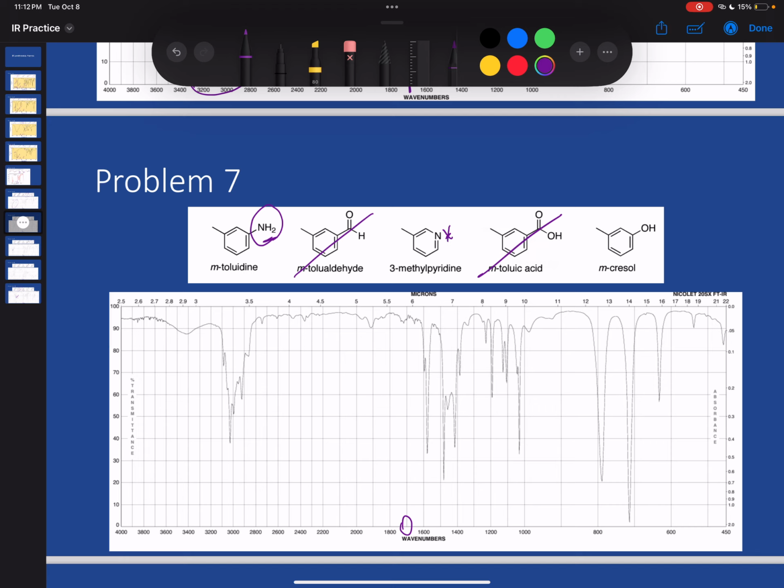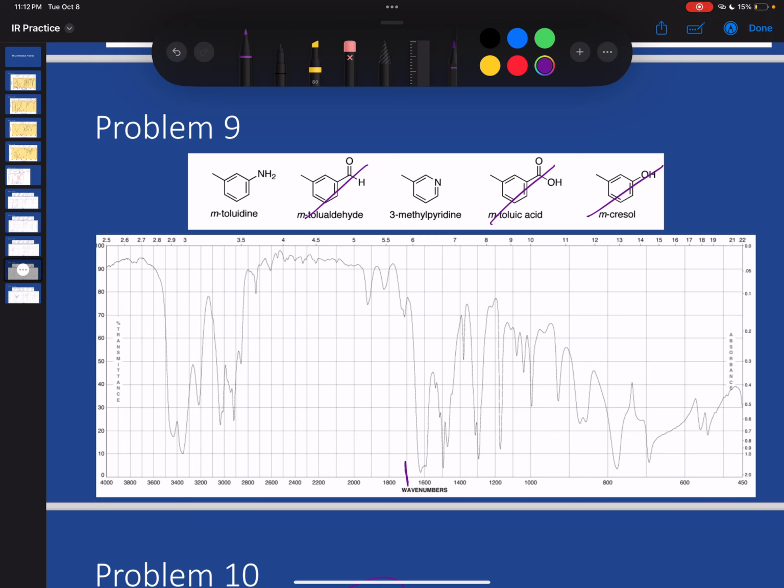So I'm going to look at the hydrogen region for this, and that's going to be 2500 and over, and I should expect to see an amine peak somewhere between maybe 3200 and 3600. That's a little broad, but let's see what we can find. So I'm not seeing too much here. But if we go to this one here, I'm starting to see something there. With this one, I would expect to see 2 peaks. This looks like it's 2 nitrogen-hydrogen peaks. I would guess that this is the one that has the primary amine, because I can see those 2 hydrogens.